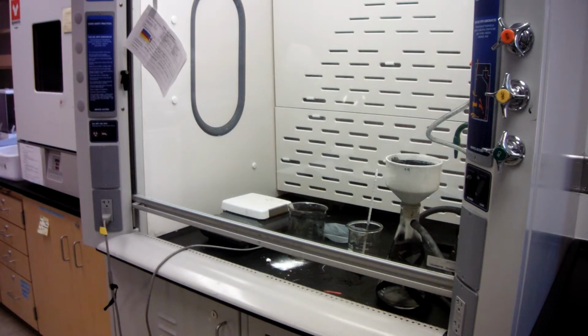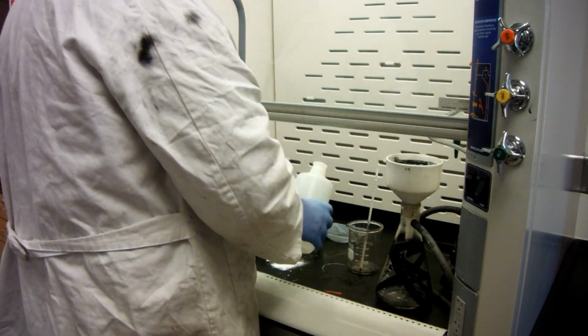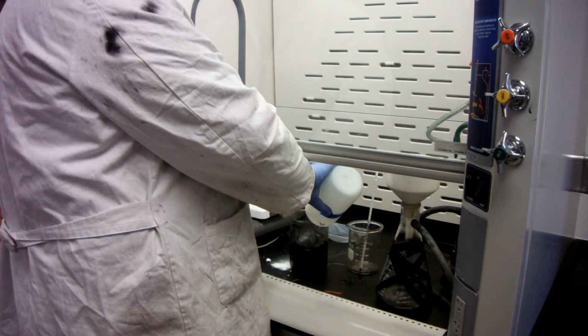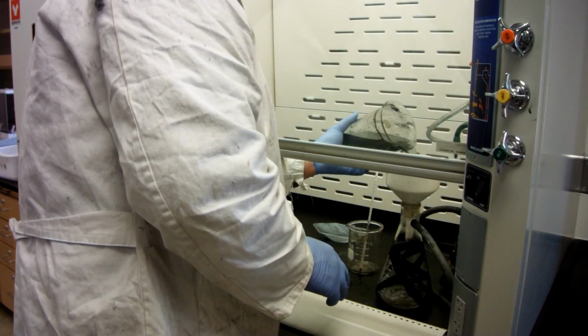I am filling DI water in the receptacle to pour into the vacuum filter. I am also pouring more DI water in here to clean this out. Plus I'm going to be using DI water to rinse out the beaker. And I'll be doing this continuously until I get neutral on the pH paper.